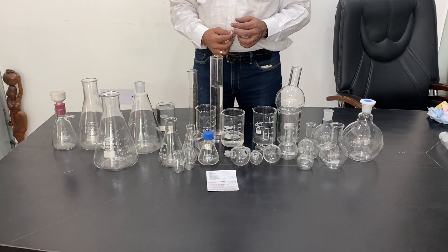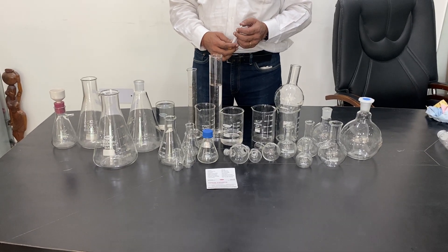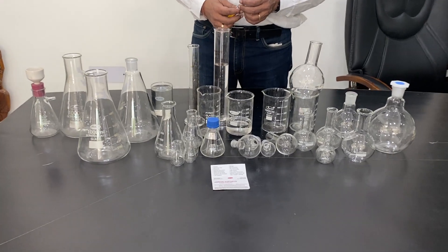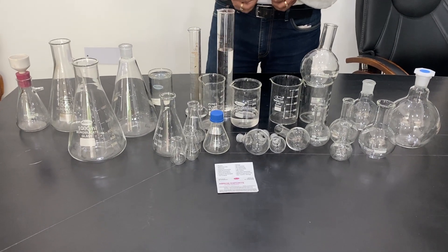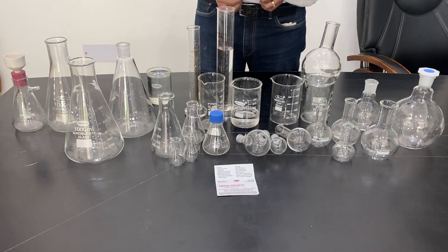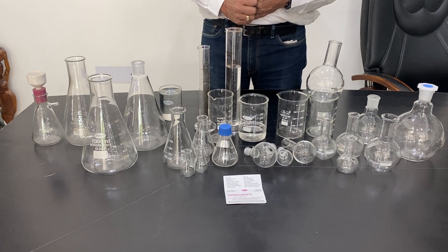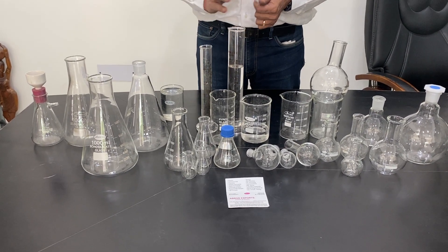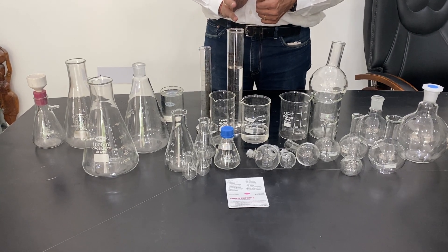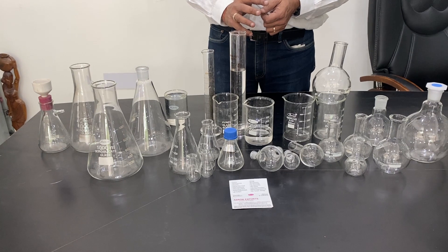Welcome to another video by Abraham. Today we will study the different kinds of laboratory glassware. It is mostly made of borosilicate glass nowadays; soda glass and hard glass are also available. They cannot be heated aggressively — only very slowly and at low temperatures. These are heat resistant up to around 300–500 degrees.